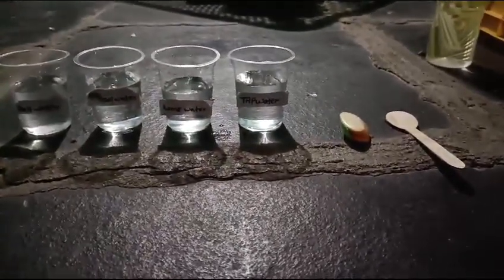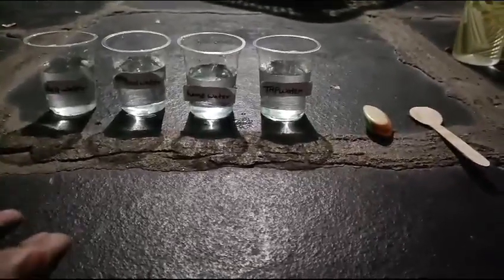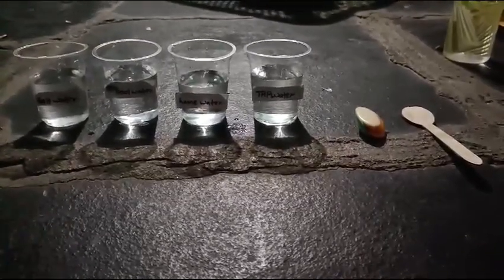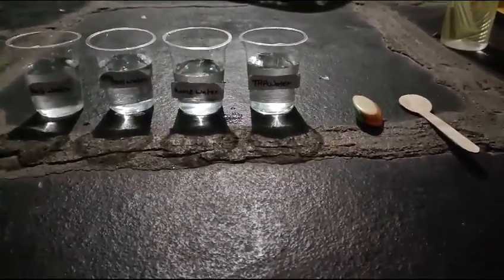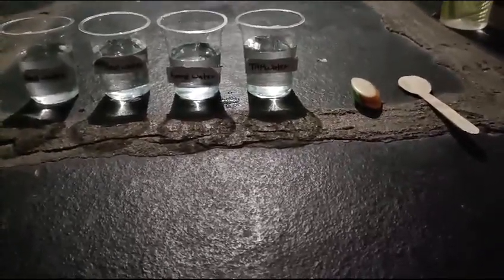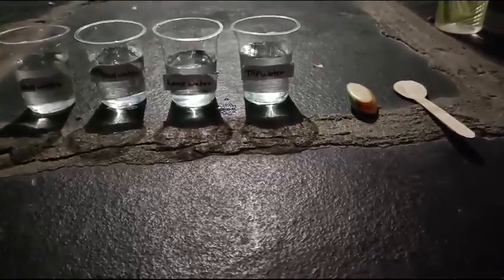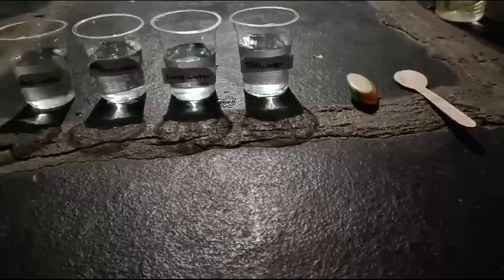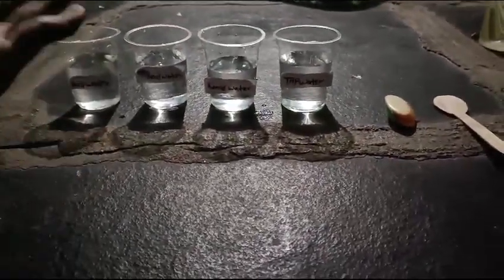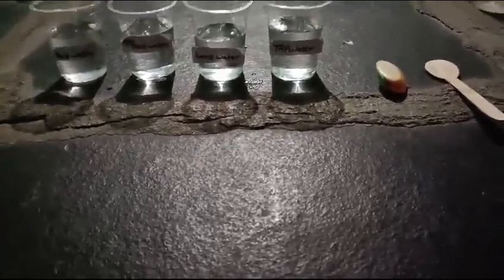Why are they kept here? Do you know anyone? No. And why are they kept? Because we have to see the softness and hardness of the water and how much salt is dissolved. If we drink water with more dissolved salt, our heart may be damaged and it may cause death. We have to find which water is pure, which water has less dissolved salt, and which is perfect for drinking.